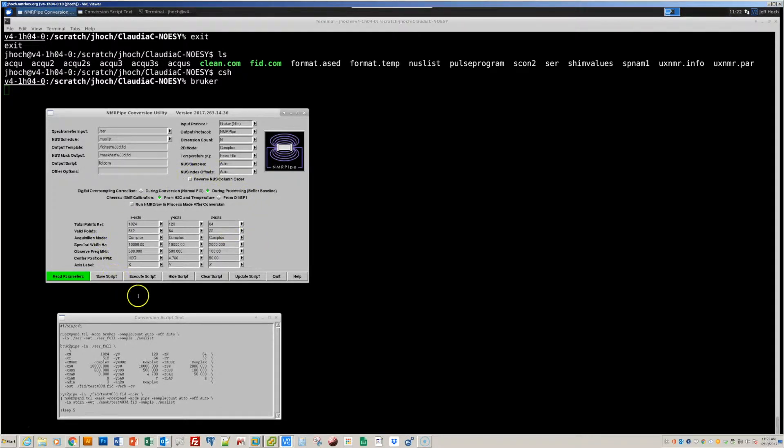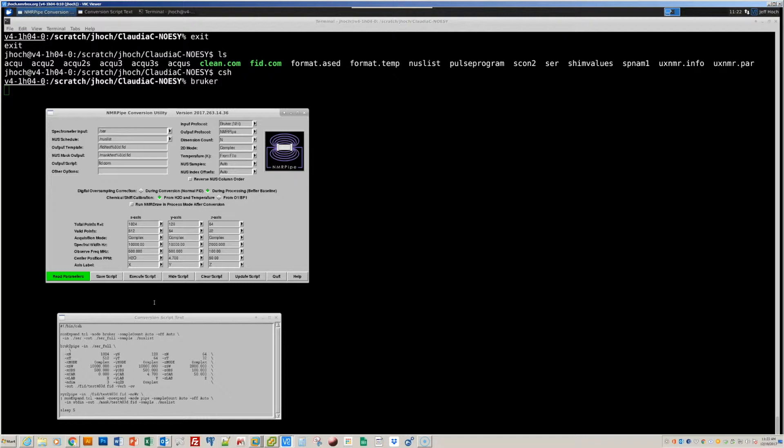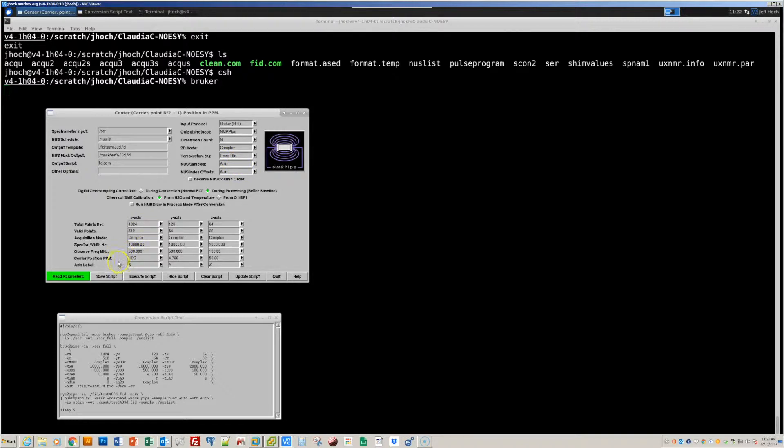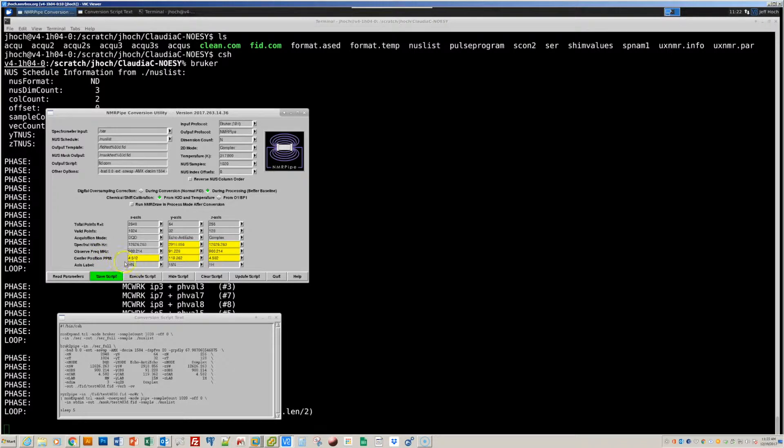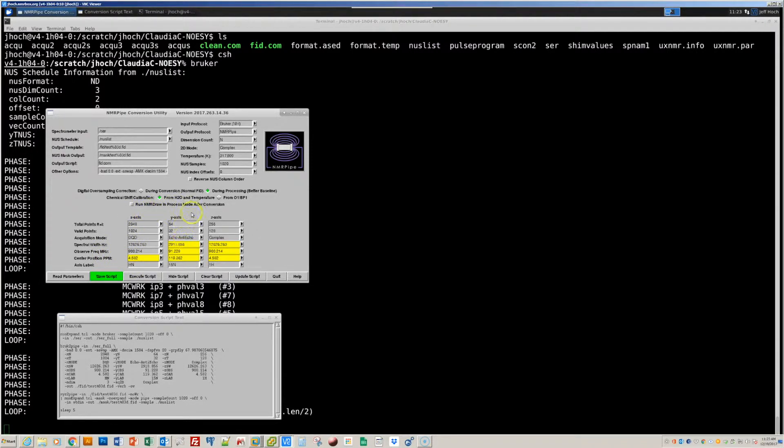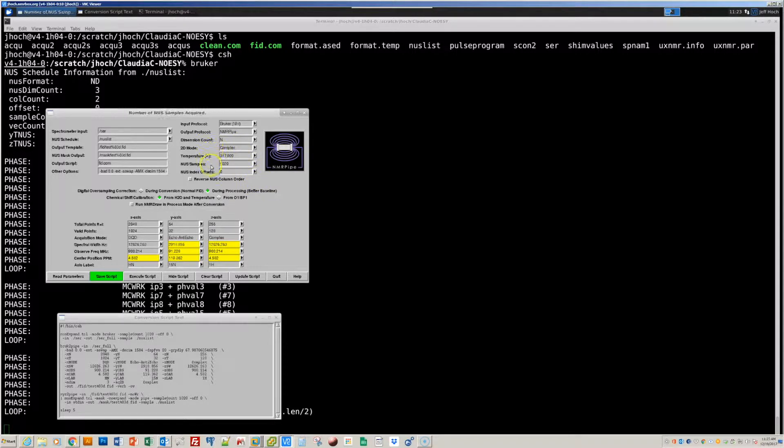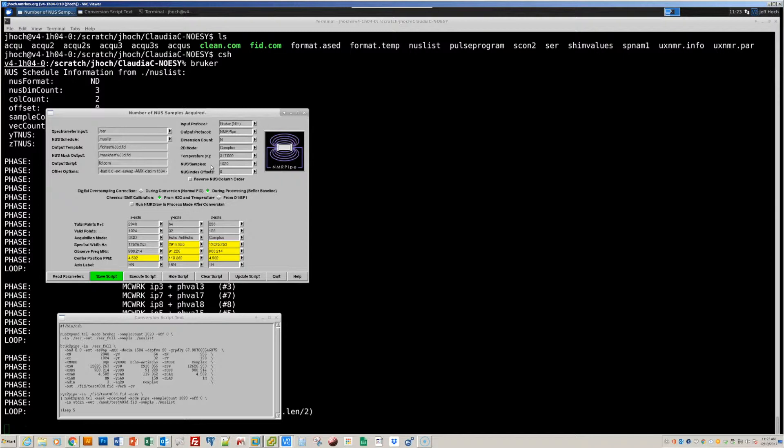The conversion script that we create will establish chemical shift calibration parameters. And by default, NMR pipe does this by assuming that the directly detected dimension is centered at water. And so it will read the temperature of acquisition from the spectrometer parameter file. And that's specified in this setting here. And then assuming that the center of the directly detected dimension is at water, when we read the spectrometer parameters, it will establish the chemical shift of water at the given temperature, and then propagate that chemical shift calibration information to the other dimensions. From time to time, the temperature recorded in the parameter file does not match the temperature that was actually used for the acquisition.